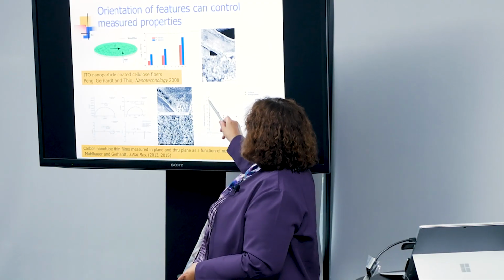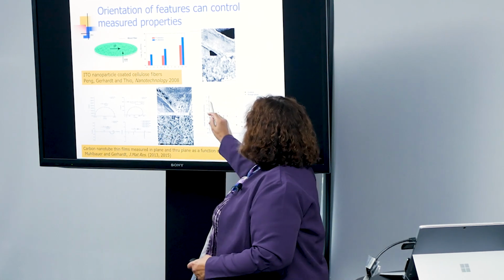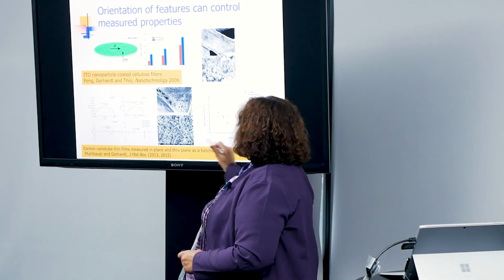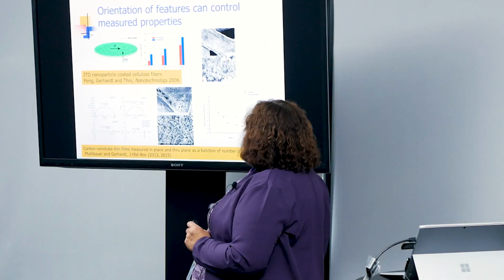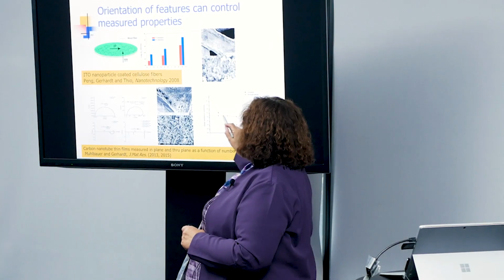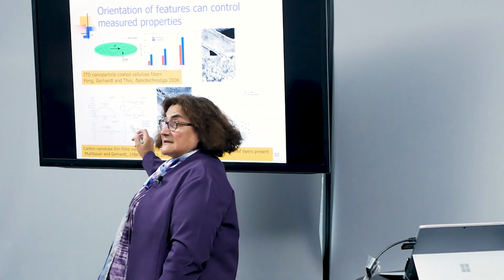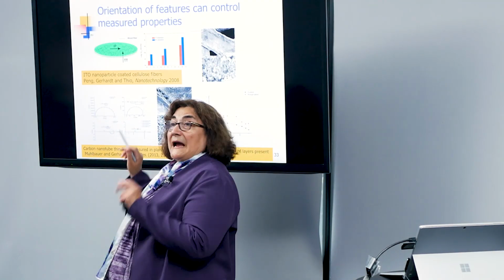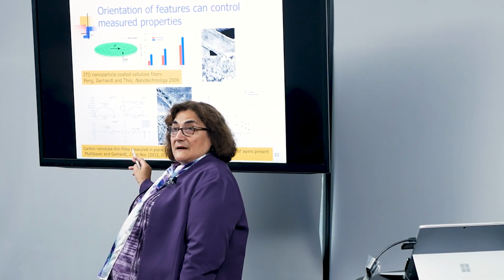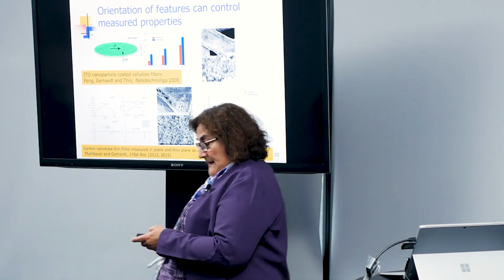And when you make measurements in plane, meaning along the length of where the nanotubes are, you can actually see about 10 orders of magnitude difference in the resistance depending on how thick the layers are, whereas if you make a measurement through the thickness of the film, the change is not as drastic. And just to illustrate, I don't have time to explain this in great detail, but depending on how thick the film is, you may see very different response associated with the same material because of the way that it is being interconnected.